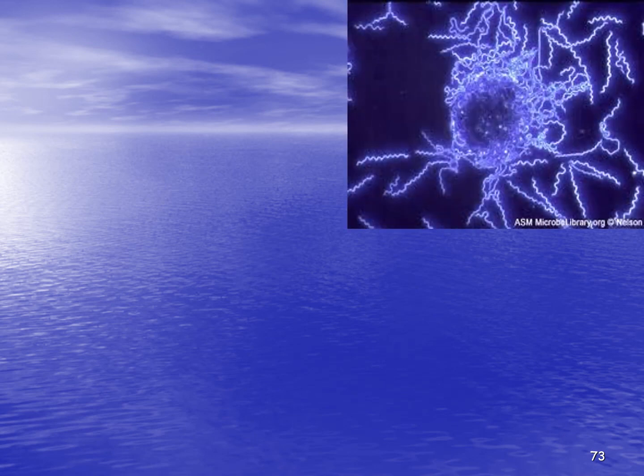This one is actually a dark field microscope. And what we'll see is, again, we have light organisms, this is a big cell and these are bacteria, against a dark background.